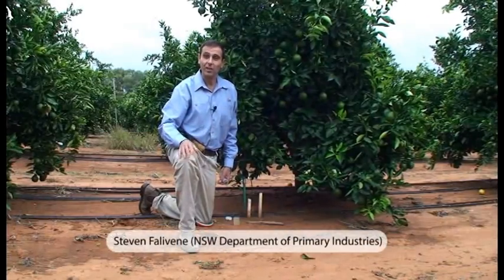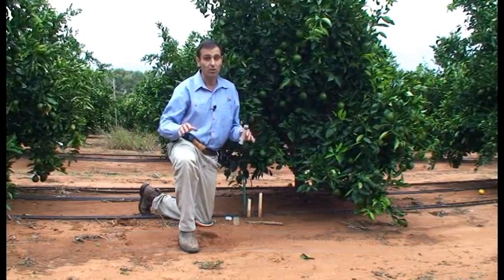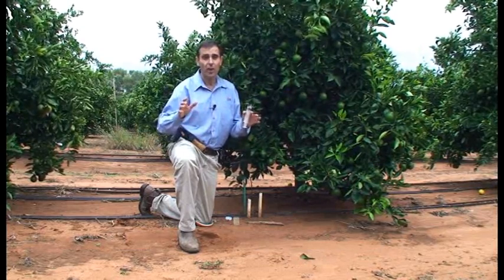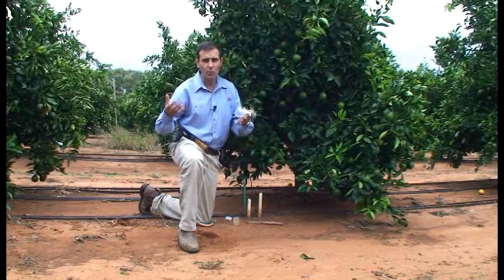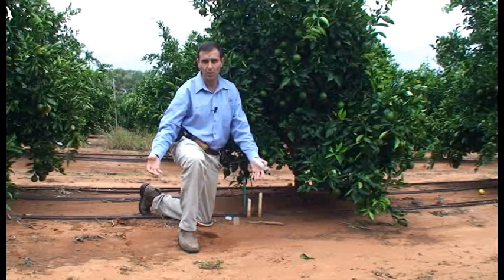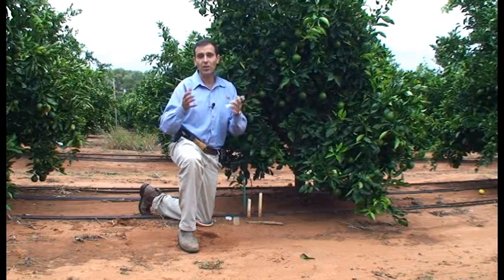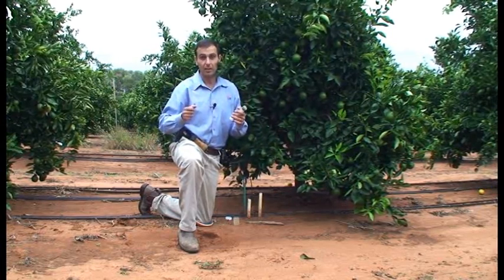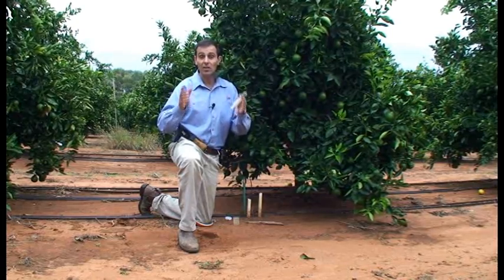Soil solution analysis is a great way to monitor the movement and status of certain nutrients in the soil and soil salinity. It can help you identify if you are fertilizing or irrigating too heavily and washing and wasting your nutrients past the root zone, or under-irrigating and concentrating salts within the root zone. It also improves environmental sustainability. This video will provide a brief introduction into this technology.